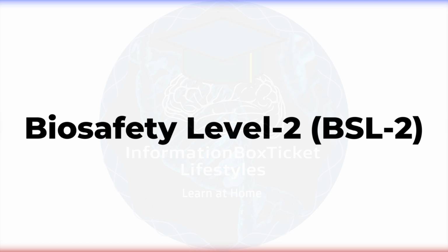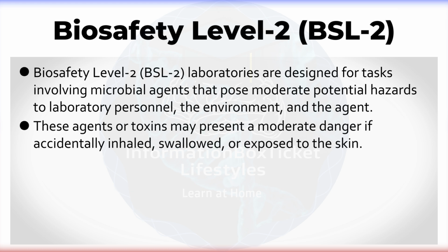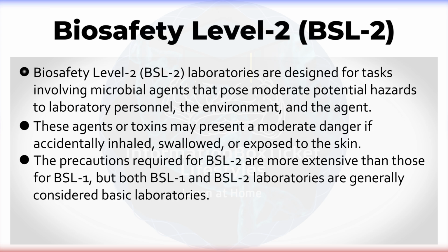Biosafety Level 2. Biosafety Level 2 laboratories are designed for tasks involving microbial agents that pose moderate potential hazards to laboratory personnel, the environment, and the agent. These agents or toxins may present a moderate danger if accidentally inhaled, swallowed, or exposed to the skin. The precautions required for BSL-2 are more extensive than those for BSL-1, but both BSL-1 and BSL-2 laboratories are generally considered basic laboratories.